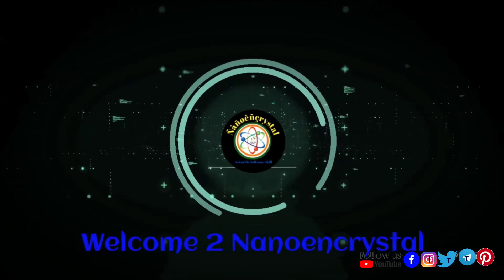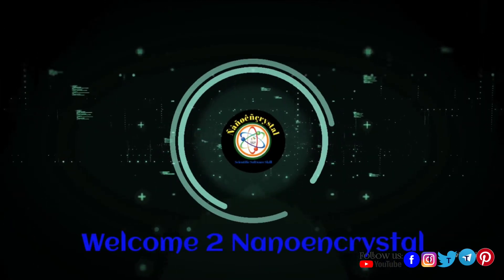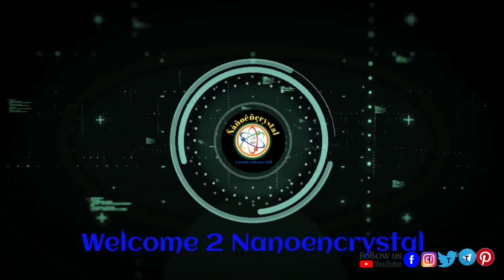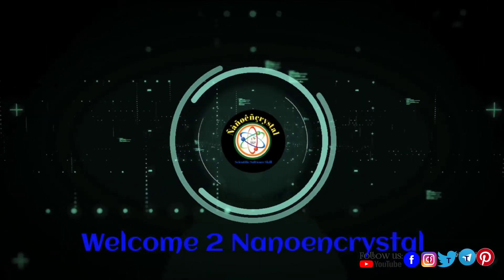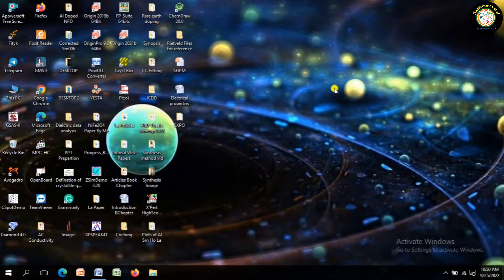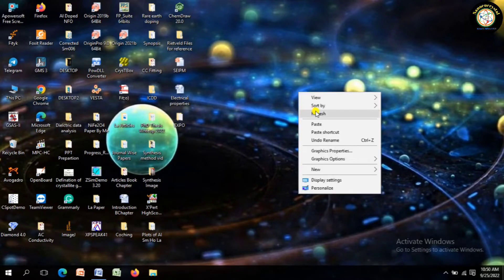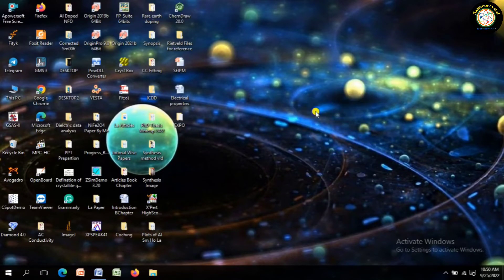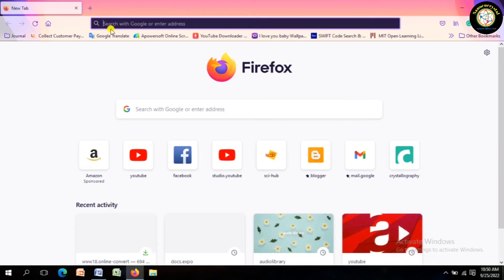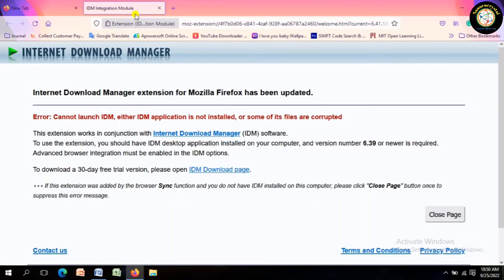Welcome to Nanoencrystal. Today, in this tutorial, I will show you how to download the EXPO 2014 package software, and estimate correct lattice parameters and space group.